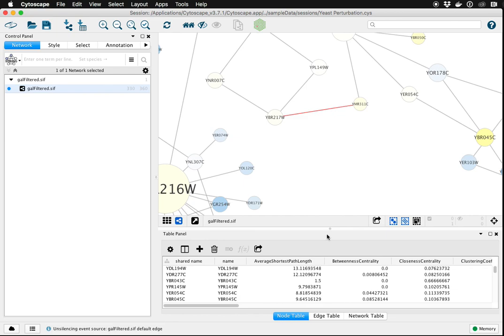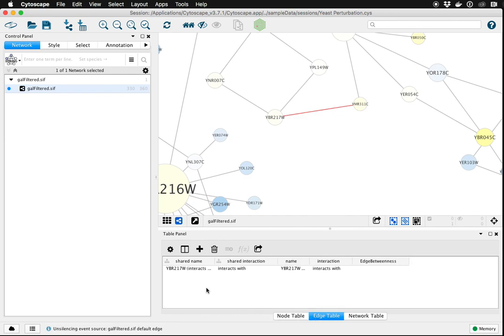This edge is now part of the edge table. Data can be loaded onto it. It can be used for visual style mappings, etc.